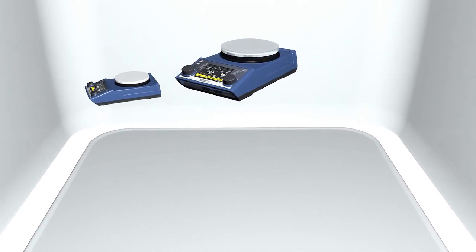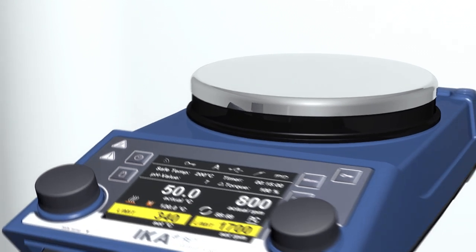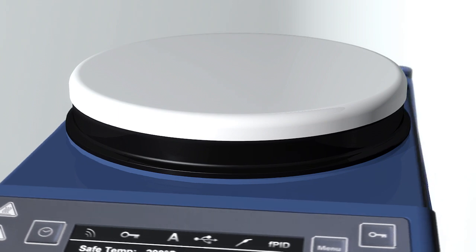The magnetic stirrer for scientists. A stainless steel heating plate enables the quickest and safest heating of samples. A ceramic coated heating plate allows for excellent chemical resistance.